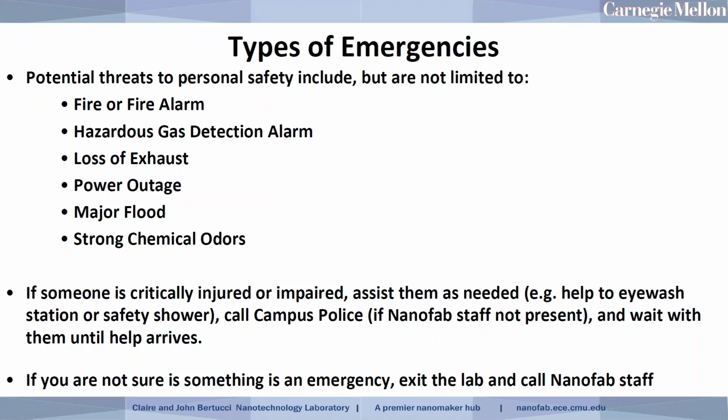A major flood, so we're talking here about a large quantity of water coming into the lab. We're not talking about a puddle or a drip from a water line or something. In that type of situation, you would let the staff know, but we're talking about huge amounts of water in the lab, like a sprinkler system failure or a massive failure somewhere that's causing a lot of water to come into the lab. So that would be a reason to evacuate. Strong chemical odors.